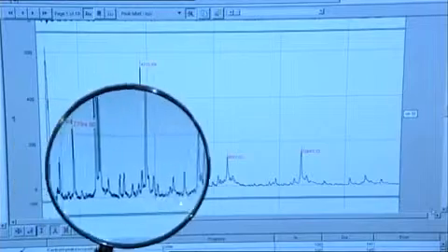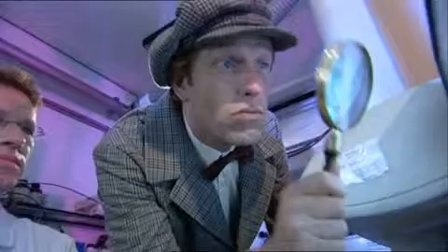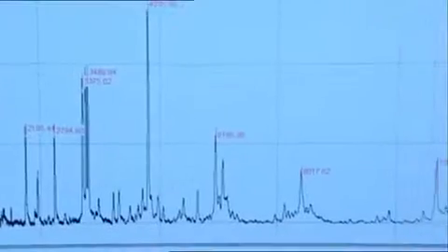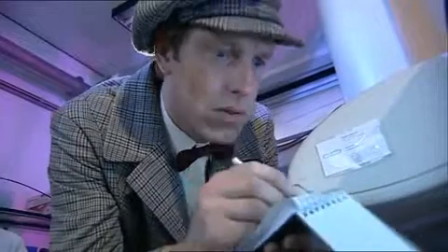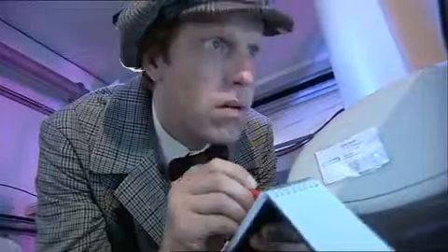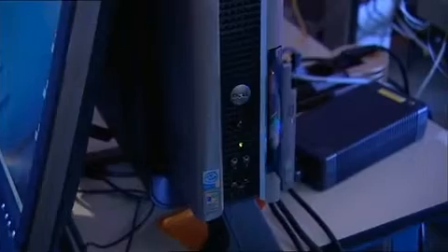Many thousand particles are affected by this laser bombardment, and all this happens under heavy surveillance. However, only about 100 suspects are actually interesting, and these need to be identified. So the essential question is, where do they hide in this vast amount of information? An intractable task for investigators of the old school. Storing data from only a single blood sample requires a whole DVD.